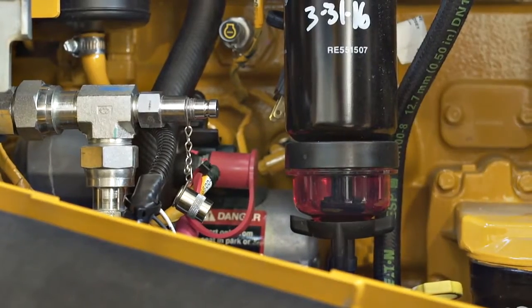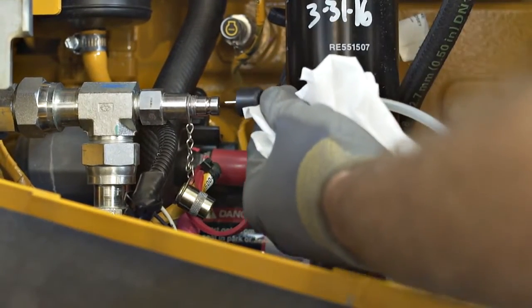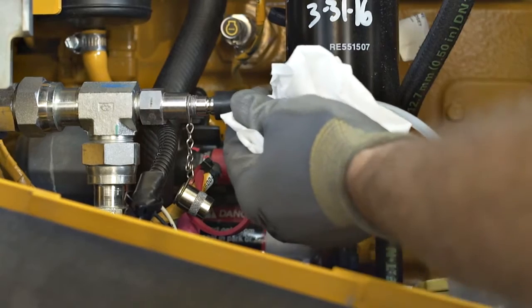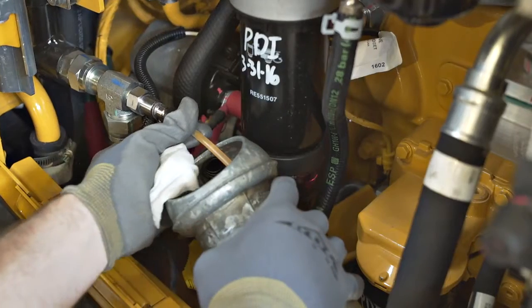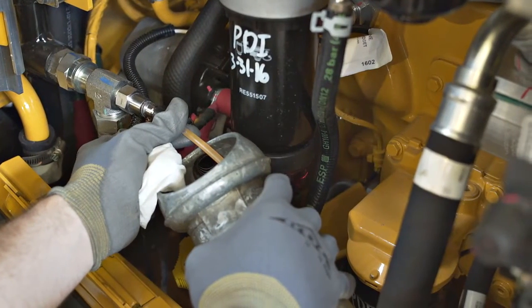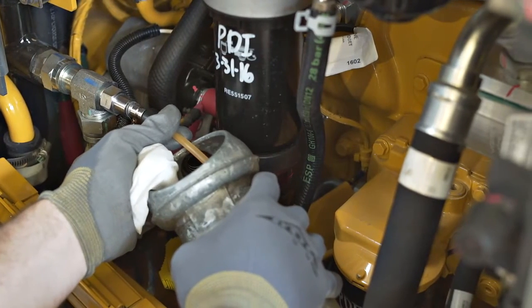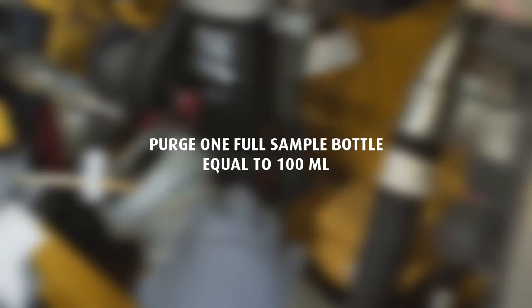Purge oil from the system to ensure a representative sample is collected in a test collection bottle. The appropriate amount of waste oil is determined by the distance of the sampling valve from the flow of the system. It is recommended one full sample bottle, equal to 100 milliliters, is purged from a remotely mounted valve prior to collecting the sample. Properly dispose of collected waste fluid.